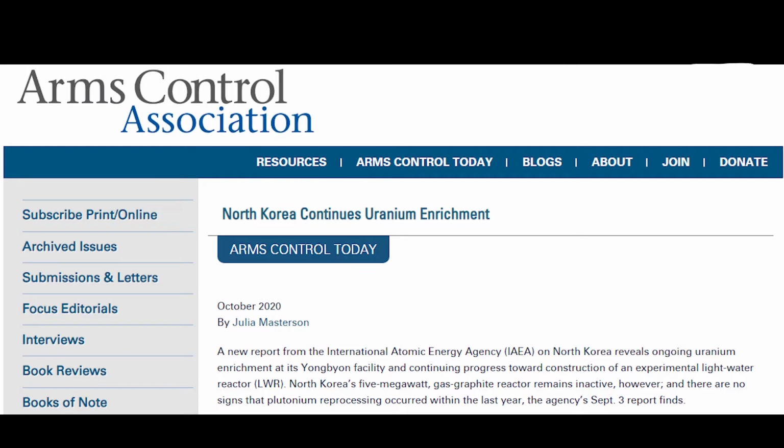So that kind of information, when you see that in the news, like they're continuing to make nuclear weapons or they stop making nuclear weapons, a lot of the basis of that information is mass spectrometry, ICP or thermal ionization mass spectrometry, and looking at the ratios of uranium and plutonium and other important lanthanide and actinide elements. So that's what we call nuclear forensics.